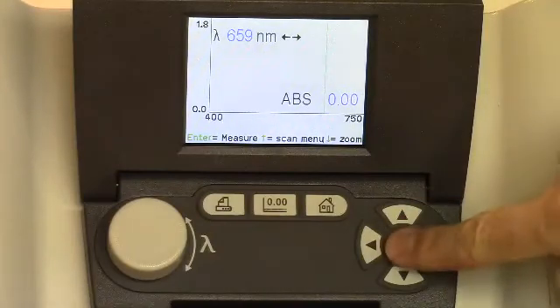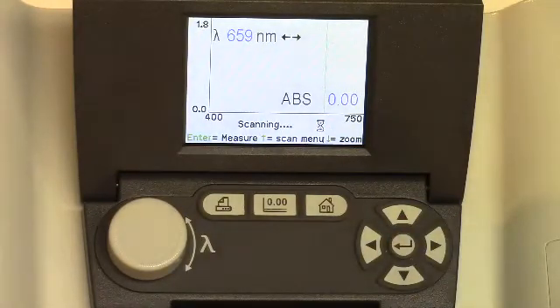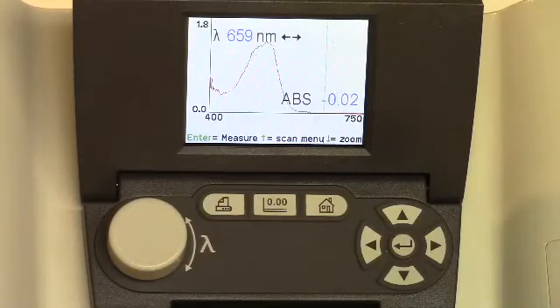So we'll close the cover here, and we're ready to scan. I'll hit the scan button there, and it should give us a nice little scan of our sample. There you go. You can see that now.